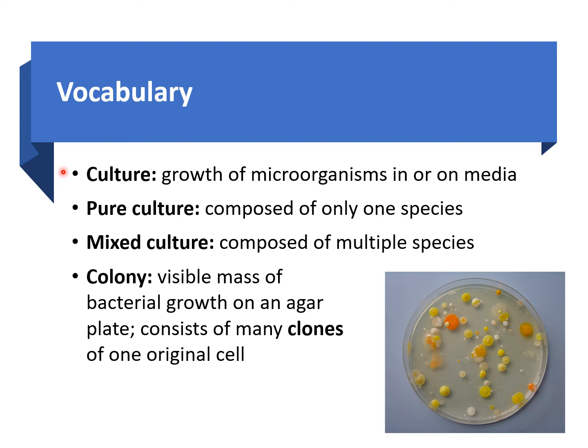I have a culture of bacteria, meaning you already have growth on your plate or in your broth. That's why we say in or on your media, because you can have cultured bacteria on a plate, on a slant, in a broth. So anytime you have growth of bacteria on your media, we refer to that as a culture.